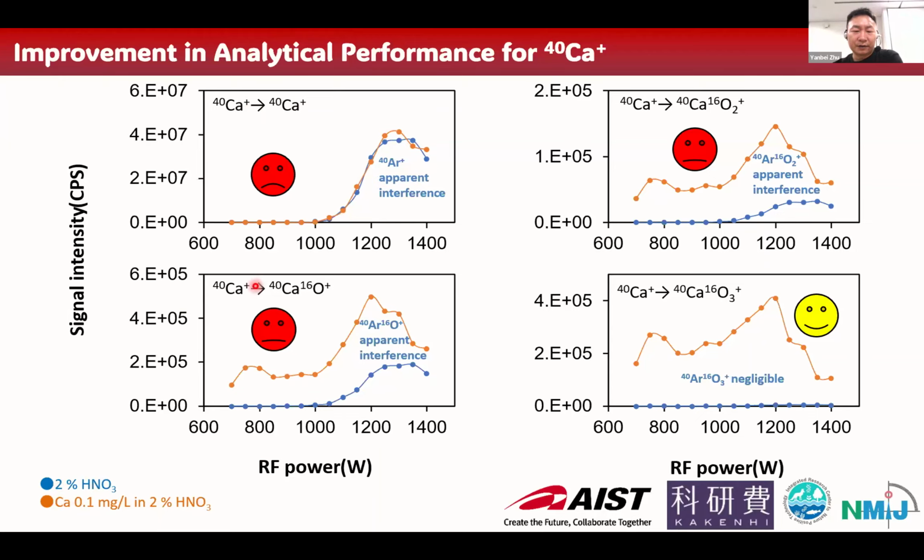For calcium to its monoxide, it's getting a little better. But especially at higher radio frequency power, you get quite sharply increased background signals.